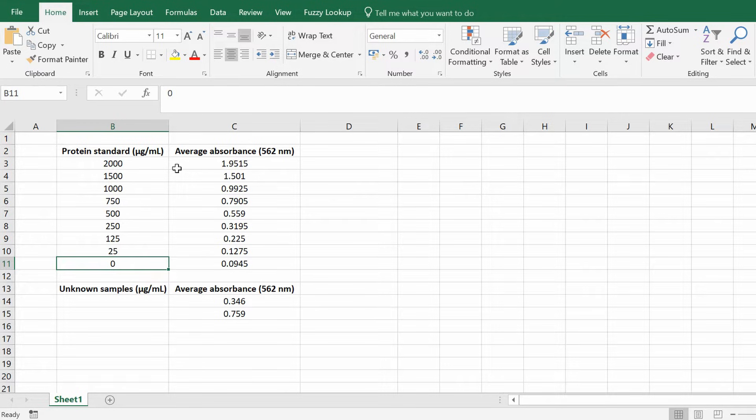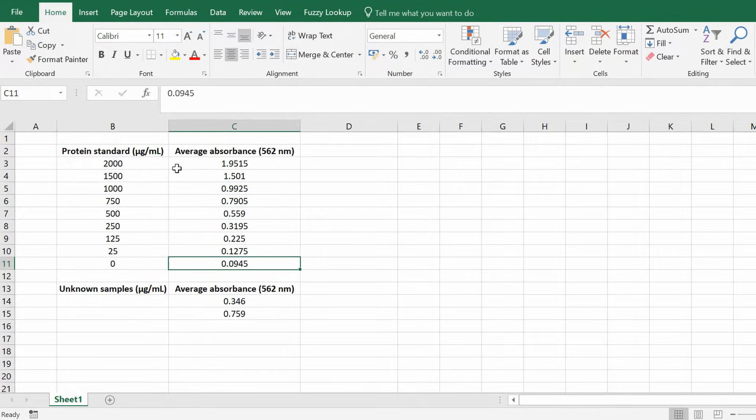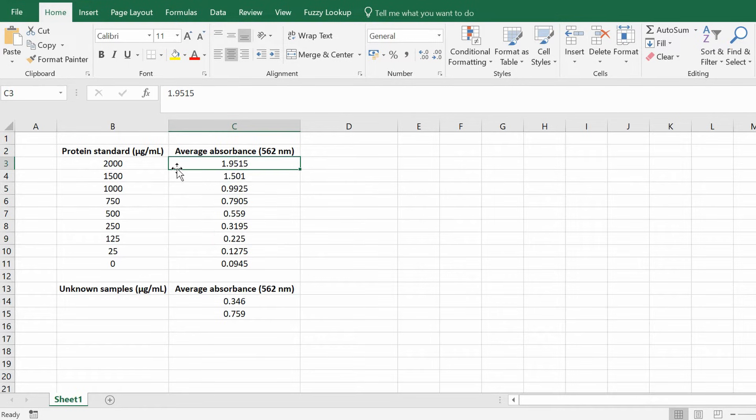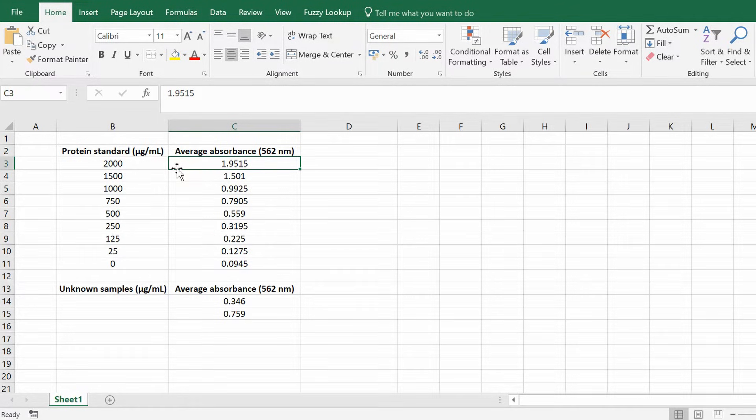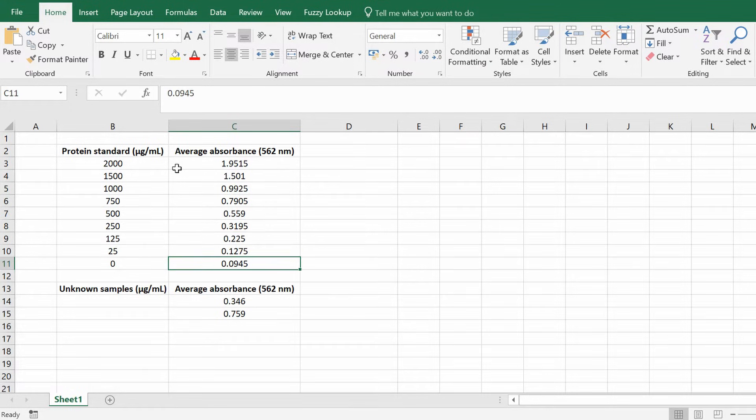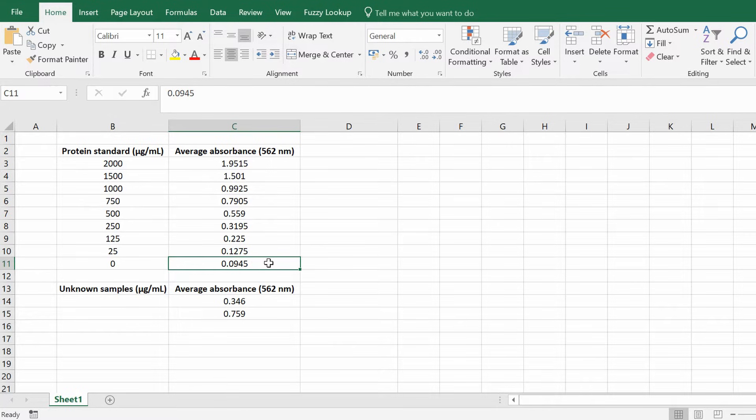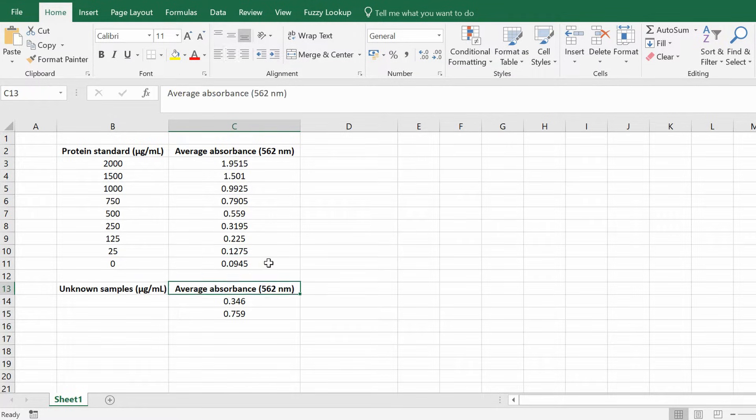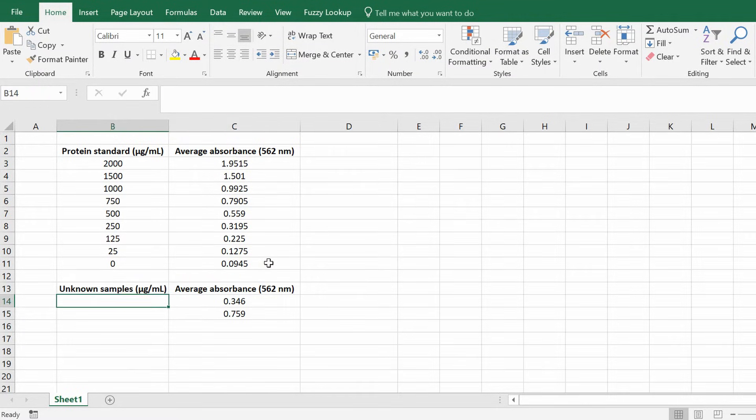So you've got 2000 micrograms per mil all the way down to 25 micrograms per mil. And I've also got a background sample which is no standard. So this is the background signal. And then by using a plate reader can measure the average absorbance for each of these samples and this is what's indicated in column C here. And then also notice that the background always gives you a very small amount of signal and then underneath this I have two unknown samples.